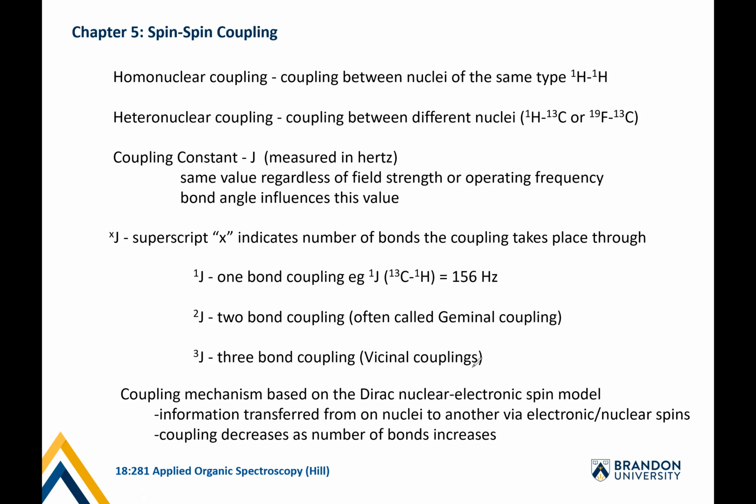So before we talked about homonuclear coupling, so this is basically coupling between the same nuclei. Proton-proton coupling was the obvious one. And then when we started the carbon NMR stuff, we actually talked about the fact that carbons and hydrogens do couple with one another. But what we typically do is decouple the hydrogen from the carbon spectra because it has a number of benefits.